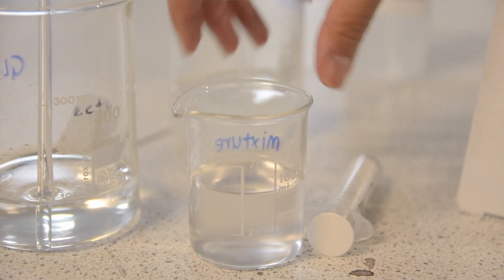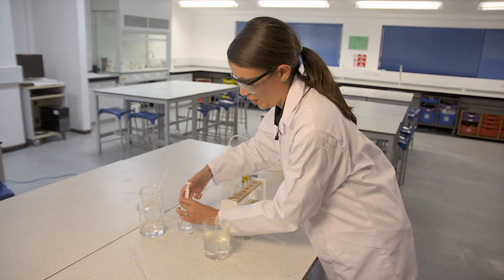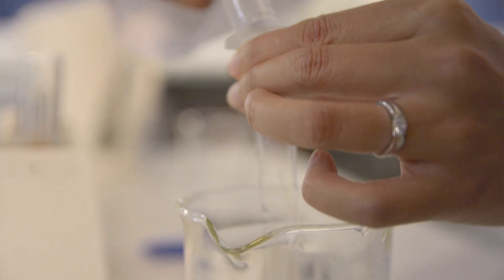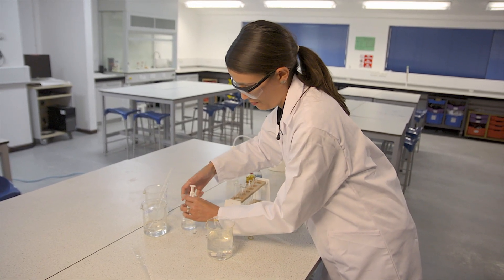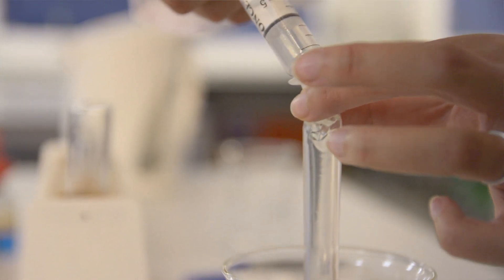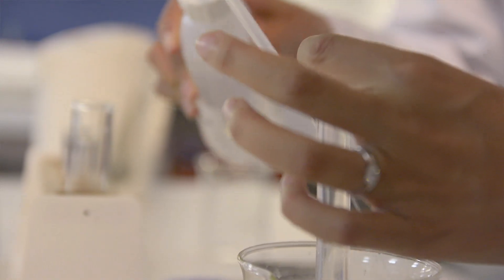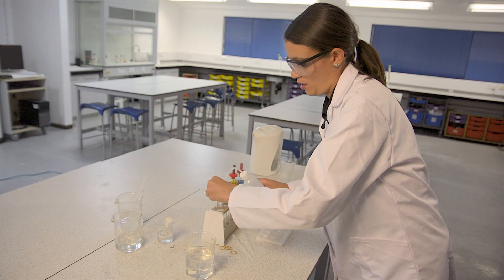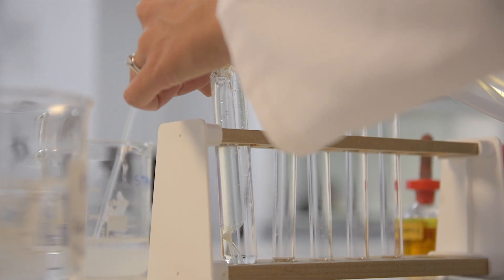Now I have my mixture of starch and glucose. I'll give that a little mix, and I'm going to syringe it into the visking tubing — you probably want between 10 and 20 millilitres in the tubing. I'm going to clean the outside of the tubing by rinsing it with some water before placing it into a boiling tube and filling the rest of the boiling tube with water. You don't need distilled water here — tap water will be fine.